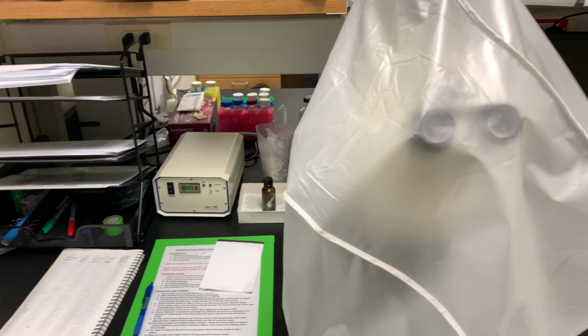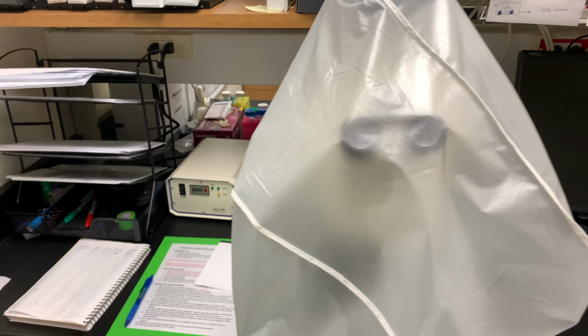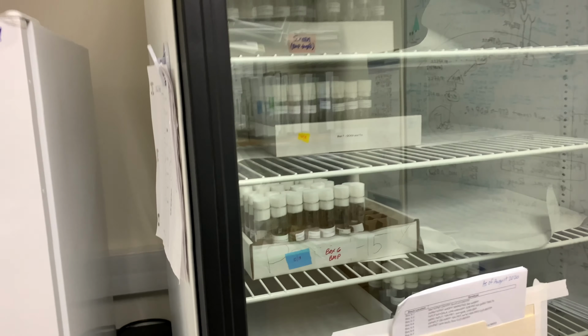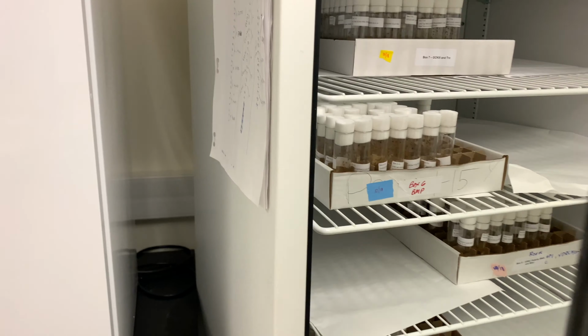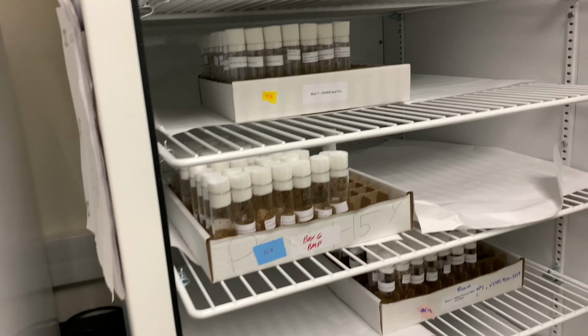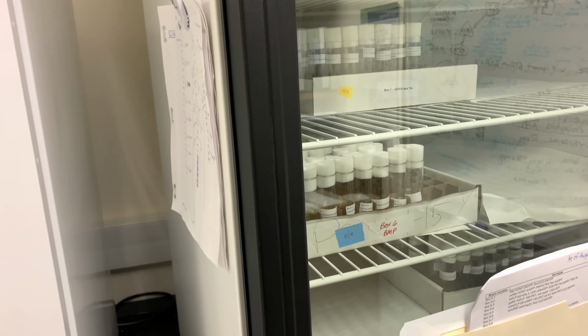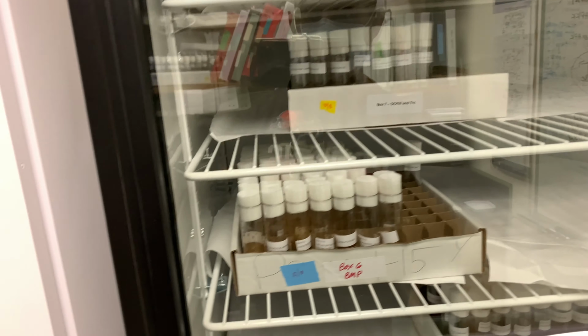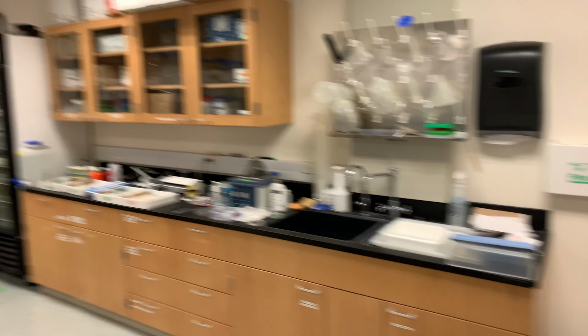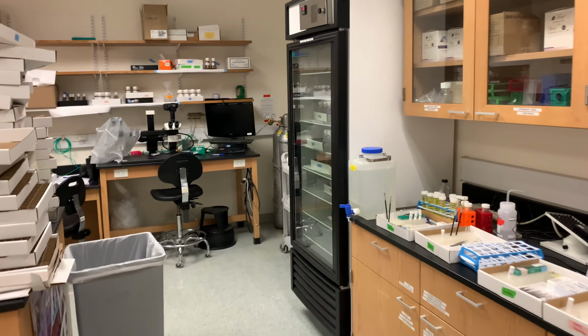We do more fly work here, specifically looking at the samples that we dissect and stain. And over here is our other fly incubator, where we keep more genotypes that we experiment with throughout the year. So there are 2 main incubators. This one holds various different genotypes that we use, and the incubator over there focuses more on what we're working on for the week.